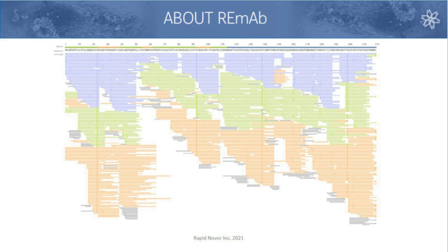And luckily, I can say that with this level of coverage that we've achieved in this kind of pure monoclonal antibody case, it serves us well as we move forward into the polyclonal antibody sequencing technology, which I'll be able to show you shortly as well.